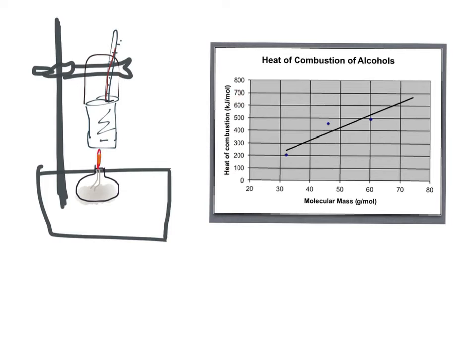So here's the heat of combustion, here's the actual results. Heat of combustion and molecular weight. Now realistically we should have a straight line going straight up, but the value for propanol was low because we had incomplete combustion occurring. This is a tin can full of water, the tin can got really sooty around the bottom because we had incomplete combustion, so we had carbon being produced, not just carbon dioxide.